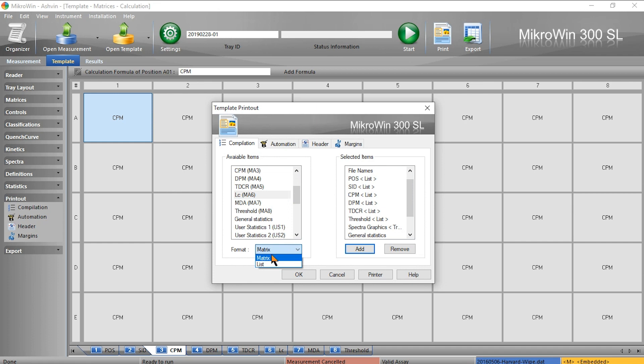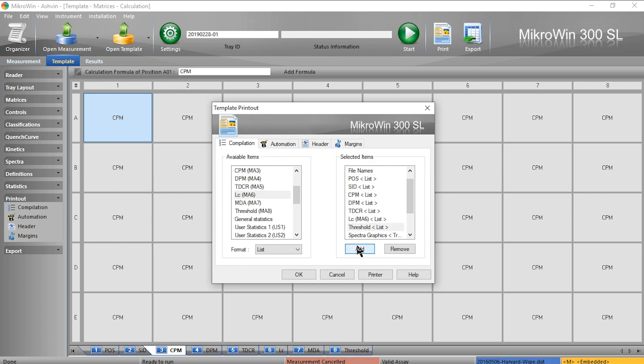I can now select where in this list I want it to go. If I click here and add, it will put it above that item. I can then repeat this for the next data point.